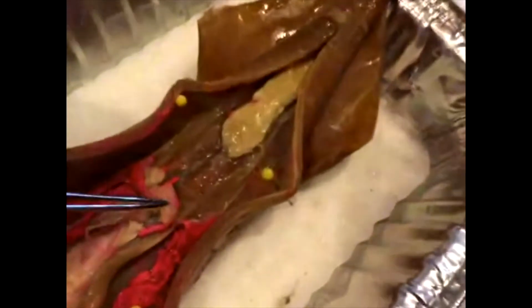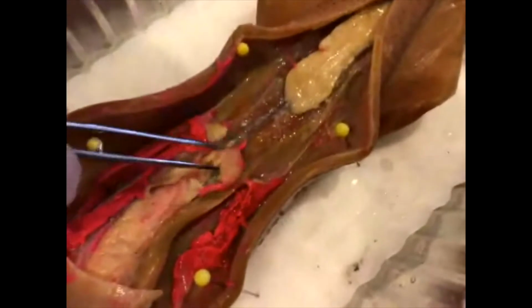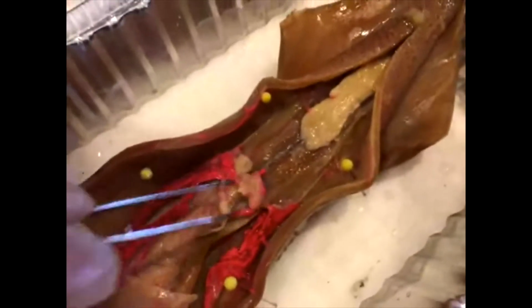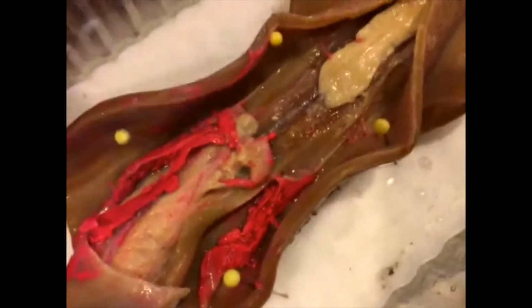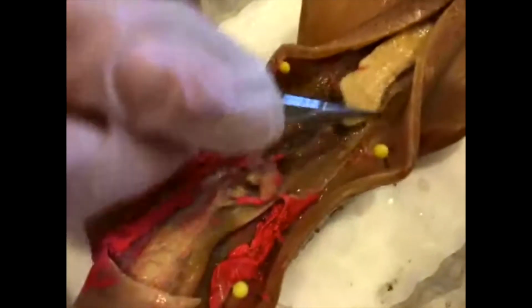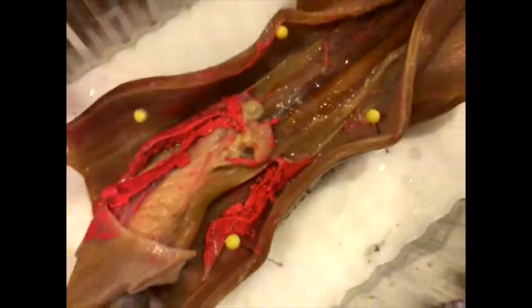Here's its heart right there. This little piece at the top of the gills. So the cool thing about a squid heart is that it actually has 3 different parts to it. The middle part in the center pumps blood to the entire body, but the 2 little parts on the sides pump blood to each of the gills. So that's something really cool about the squid.